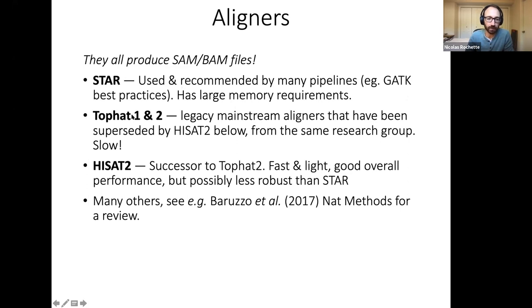Another that's very well known is TopHat. It works well, but it's been superseded by a third one, HISAT2, which is from the same authors. In terms of time and computational performance, it's faster than STAR, and it doesn't use as much memory, so it's easier to run, but it's possibly a bit less robust than STAR. I think it's another really commonly used one, and it's a good one, but here we're just going to use STAR. And then you can find reviews online where you can find all of the different approaches that have been published for this problem.